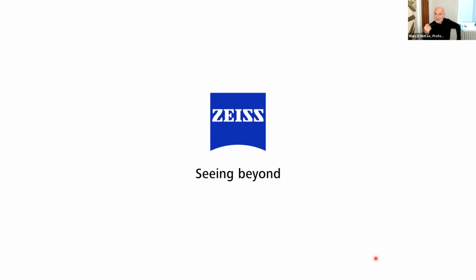I know it depends on the type of material, but how frequently is a volume actually interrupted by knife marks and so on? So that sample specifically, I went into the methods just to double check on exactly that question. It was decalcified. So that takes a lot of sting away already from the diamond knife. But since we have an expert from Diatome, and I'm trying to be very careful, he might have much more experience. He will have 100% more experience than I do with diamond knives.